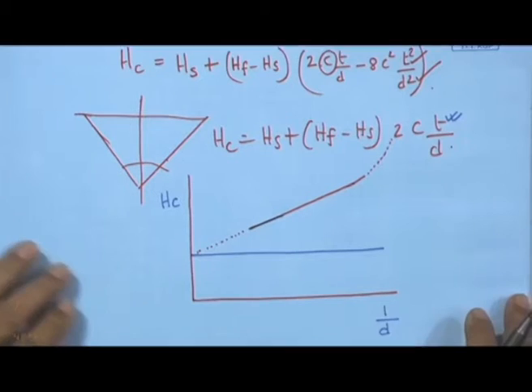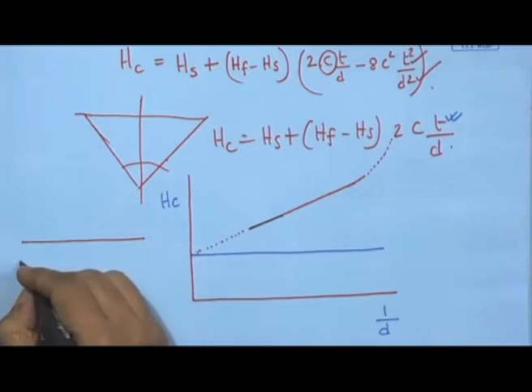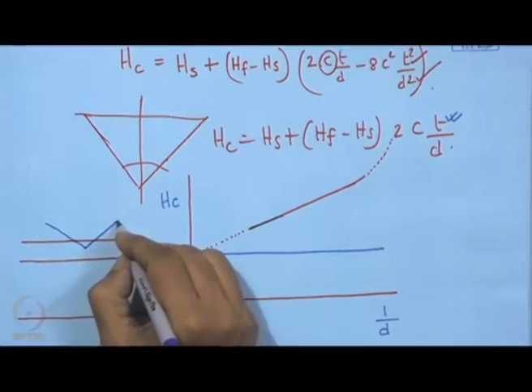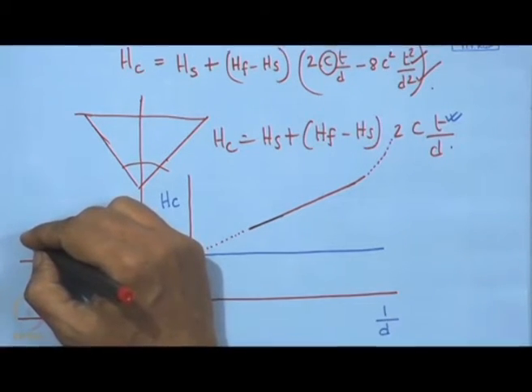For a coating, say here we have this coating and this is the substrate. Now, what happens? We measure this diagonal. Now, the length of the diagonal depends upon the load. So, 1 upon d large means d is rather small, and where 1 upon d is small, that means d is large. So, we can have two extreme situations.